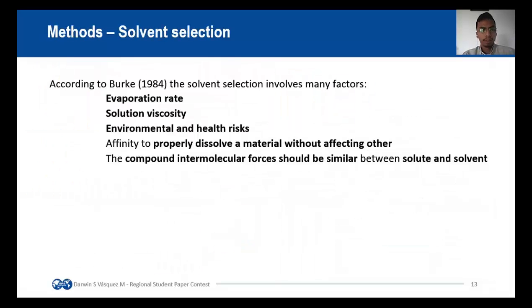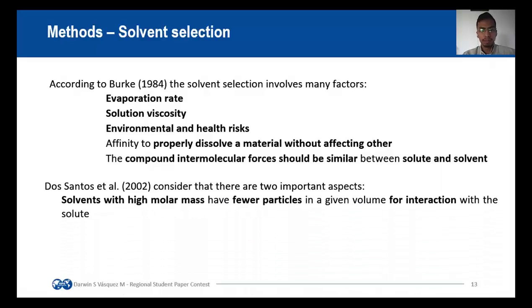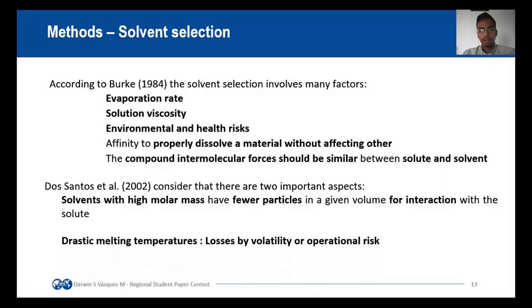According to Burke, solvent selection involves many factors, such as evaporation rate, solution viscosity, environmental and health risk, and affinity to properly dissolve a material without affecting others. The intermolecular forces of the components should be similar between solute and solvent. Dos Santos considered that there are two important aspects. Solvents with high molar mass have fewer particles in a given volume to interact with the solute, and drastic melting temperatures can generate losses by volatility or require special measuring equipment.